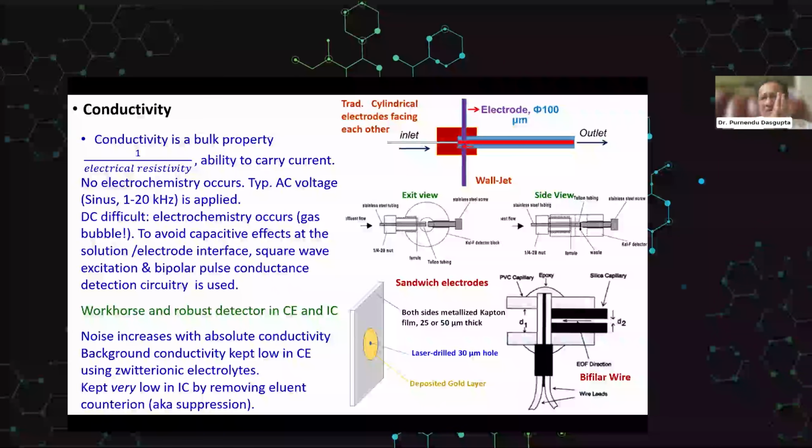Imagine, you remember these telescopes, they have all this gold looking thing. So they're gold evaporated on Kapton. Kapton is an insulator. Imagine you have gold layers on both sides of that Kapton and you make a hole in it, so that the two sides are electrically isolated from each other because the Kapton is in between. So you make those two the electrodes and pass the solution in between. Easy for me to say, but to connect to that hole is a whole different story.